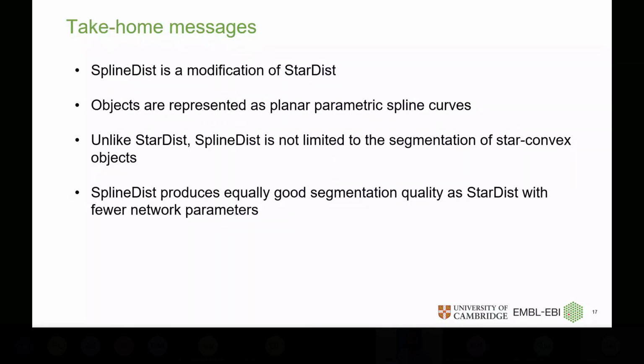So the take-home message from this talk is that what we propose is a modification over StarDist. Unlike StarDist, which models the object in terms of star-convex polygons, here we do it in terms of planar parametric spline curves.